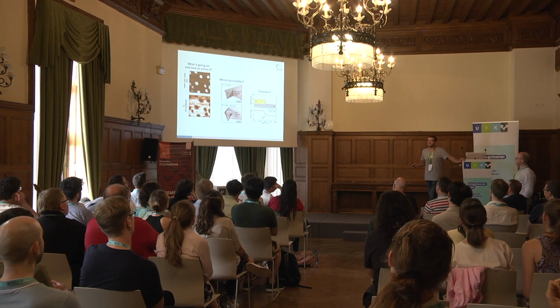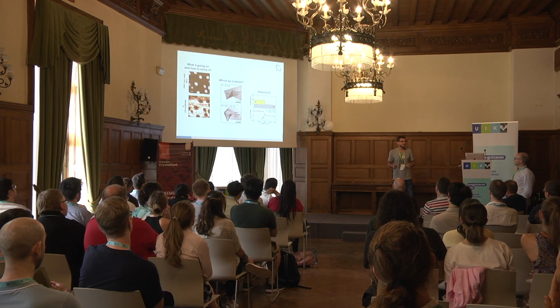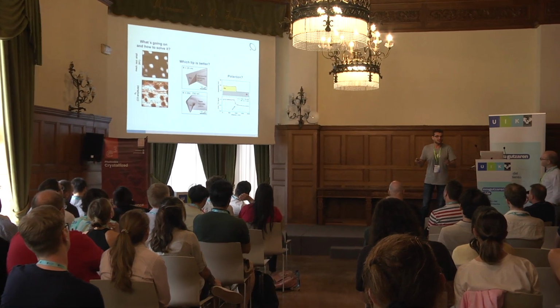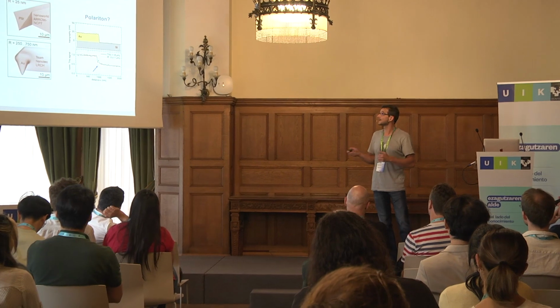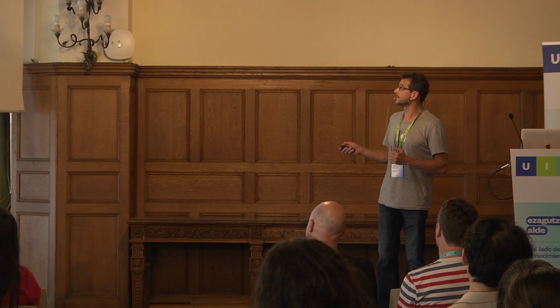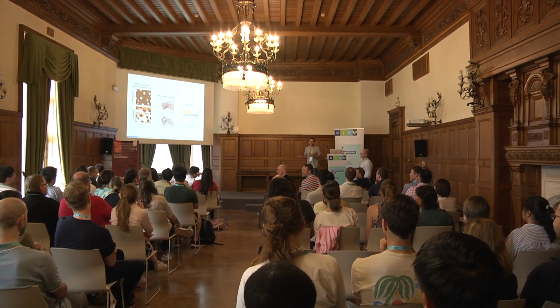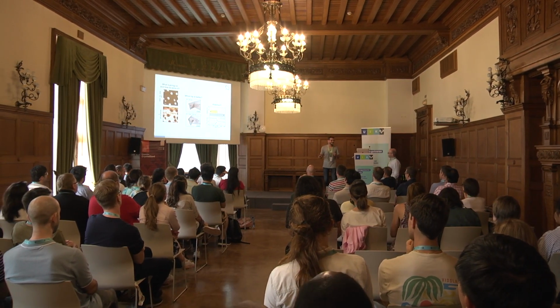Let's assume you want to scan, well, actually I showed an example. Take an hBN flake, just a dielectric map of an hBN flake that is a few micrometers large, and it's on silicon, and I would like to see this flake with a very bright, good contrast. Which tip is better, this one or this one? The blunt or the sharp one? So who is for the sharp one? Fritz, of course. And the blunt one? Okay, good, the majority. Very good. Maybe you guys read the paper.